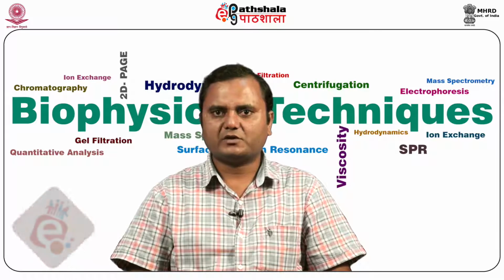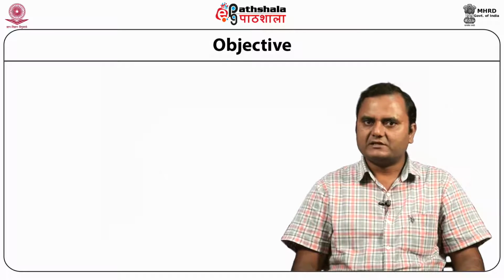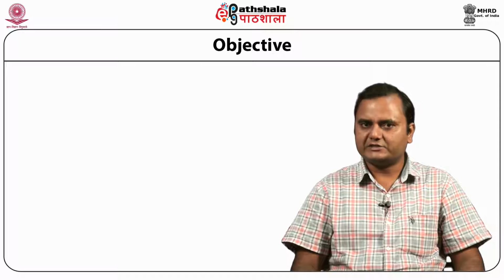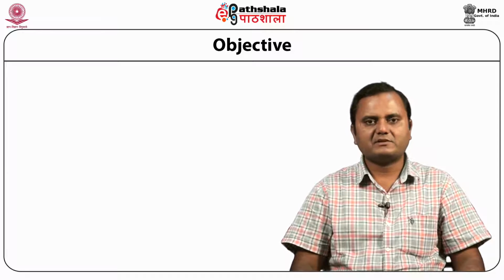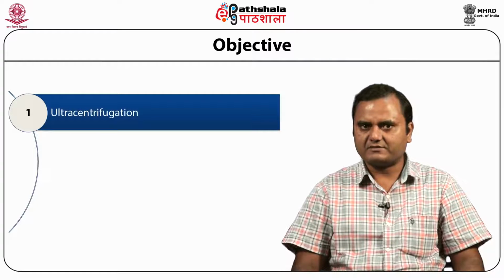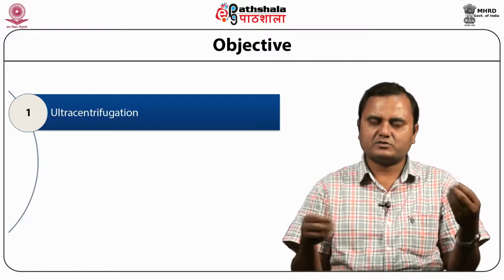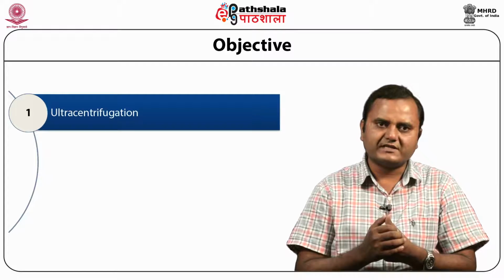Today I am going to talk about the module ultracentrifugation from the paper Centrifugation Technique. In this module we discuss the following things in detail. First, we discuss the basic concept of ultracentrifugation. What is the basic concept of ultracentrifugation? How is this technique more advanced than the other forms of centrifugation?